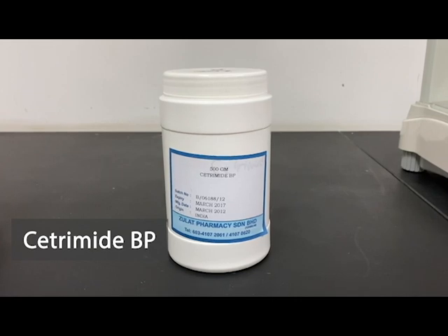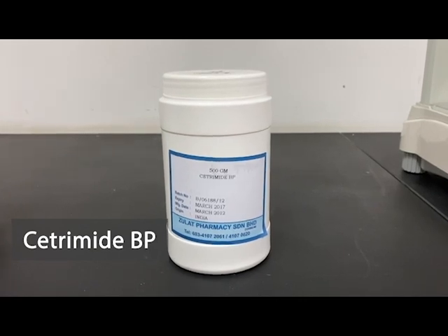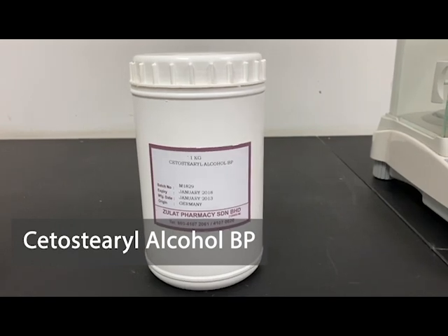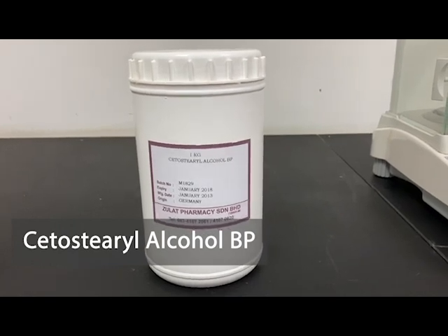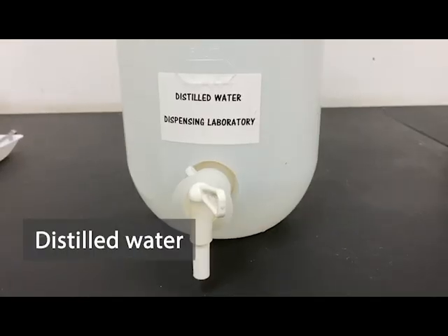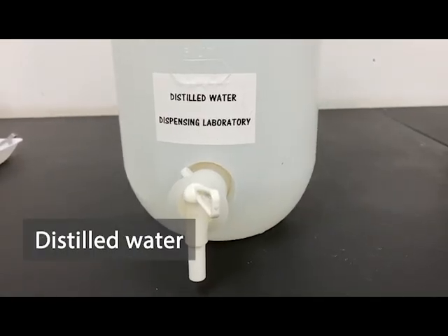For this preparation, you need Cetrimide BP, Cetostearyl Alcohol BP, Liquid Paraffin, and Distilled Water.